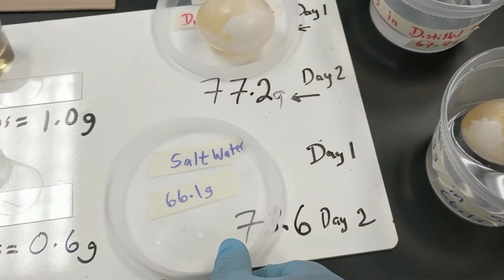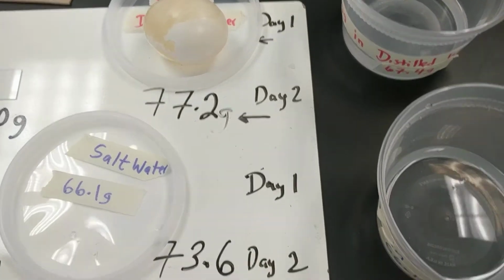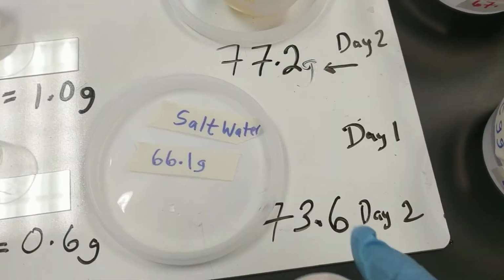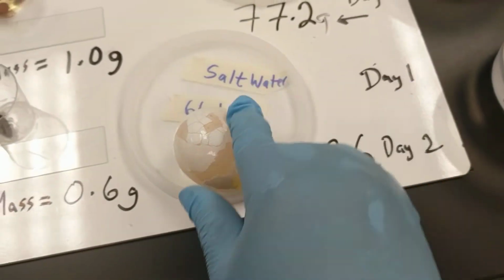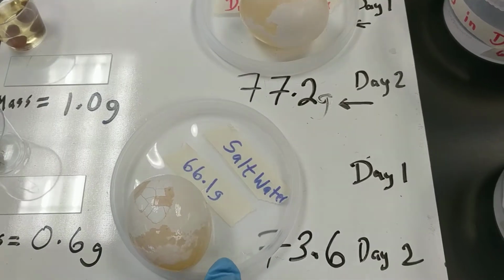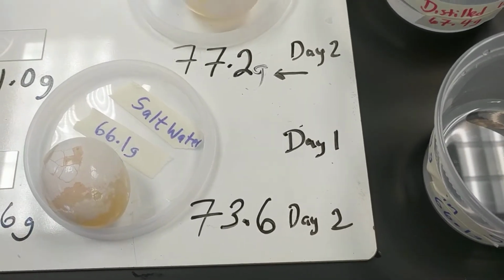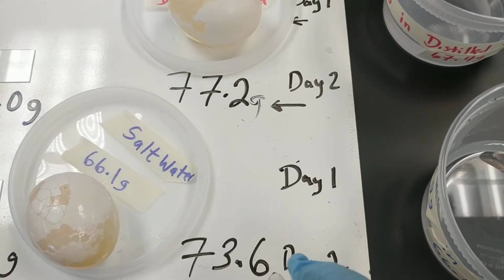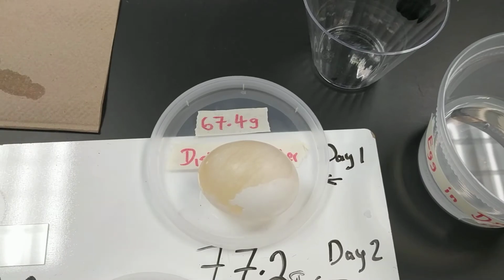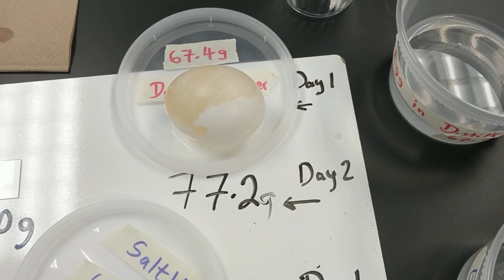So what we have here is the original mass of the egg before it was placed in salt water was 66.1 gram, and after removing it from salt water, the mass went up to 73.6 gram. The original mass for egg number 2 that was placed in distilled water was 67.4 grams, and the mass went up to 77.2 grams.